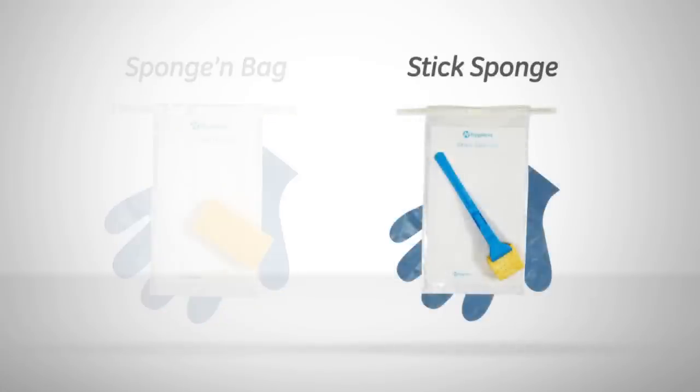For harder-to-reach areas, stick sponge comes with an easy-to-release stick that allows sample collection without directly handling the sponge, making it easier to reach into drains, pipes, and around equipment.